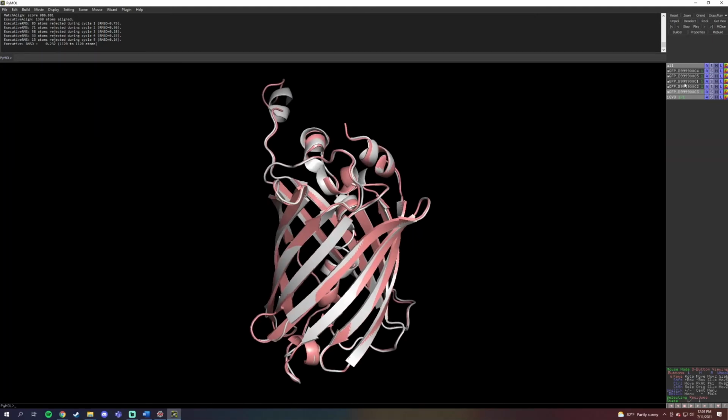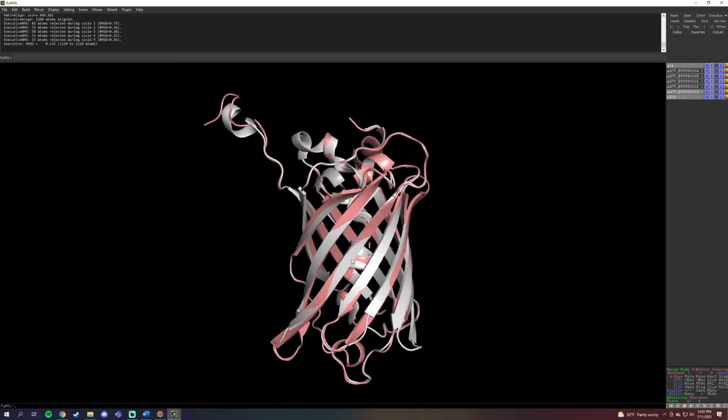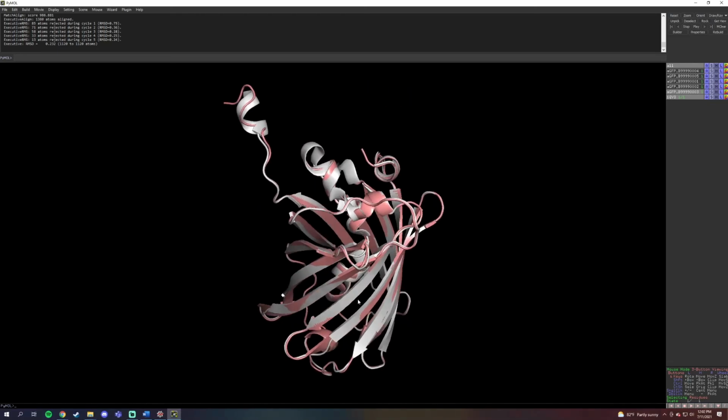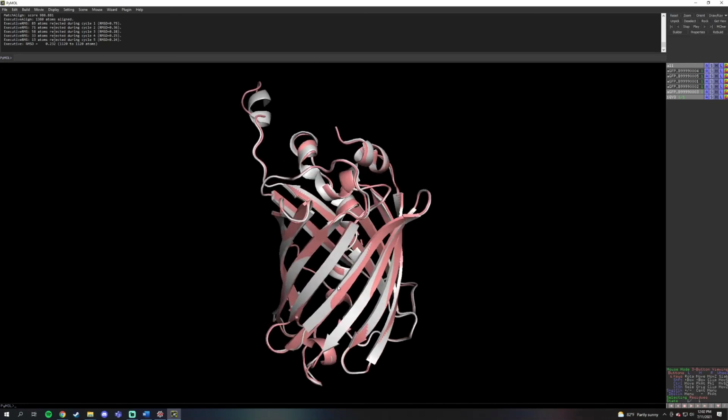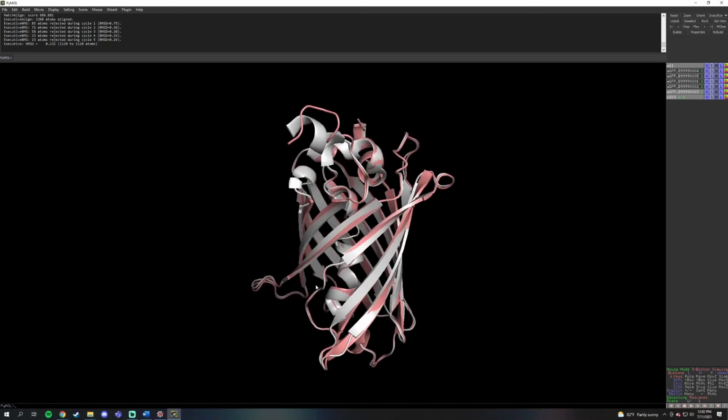That is all that I will be showing you guys today in this video. I hope that my tutorial was helpful and taught you guys how to model your protein sequence against known crystal structures. And I hope you have a fantastic day. Thank you so much for watching my video.